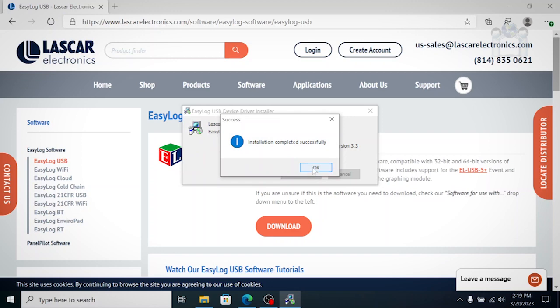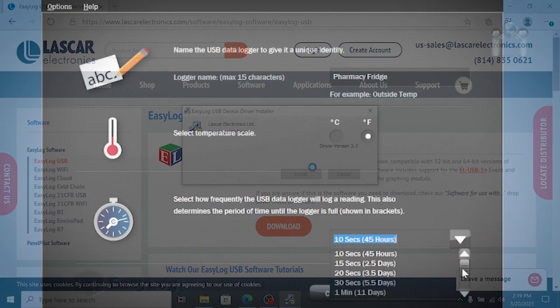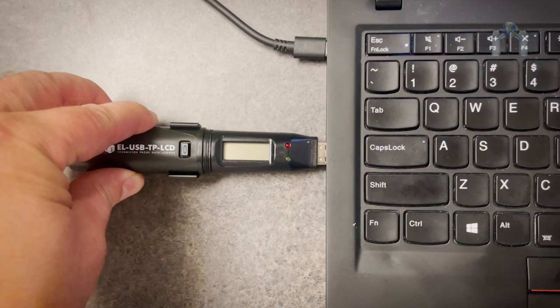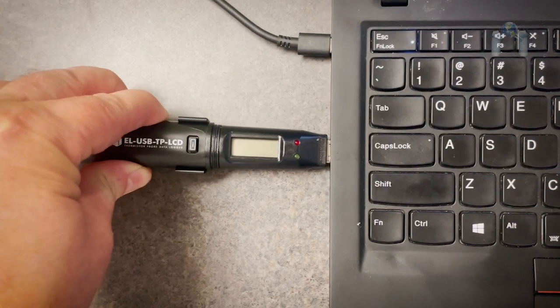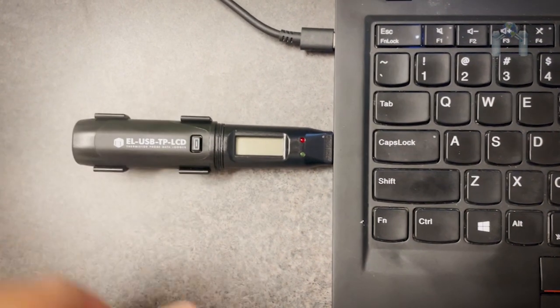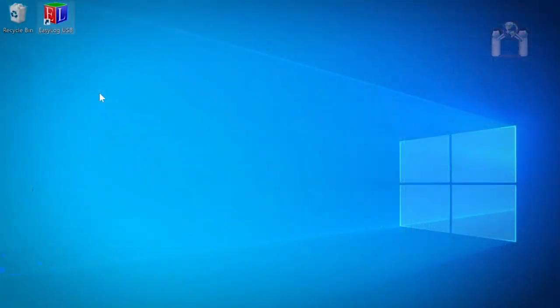Now that the installation is complete, we need to set up and start the data logger. To begin, insert the data logger into a USB port and launch the EasyLog software.